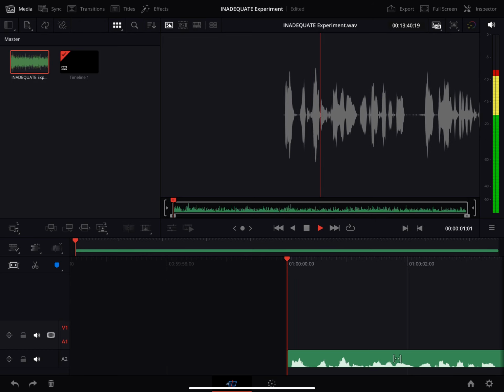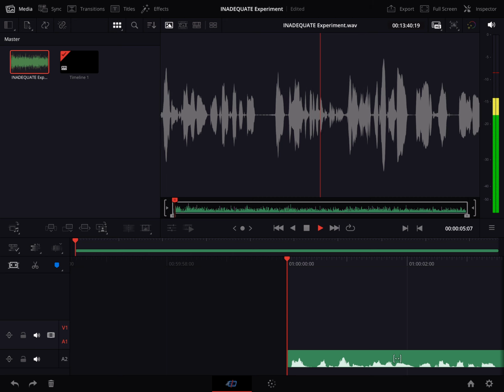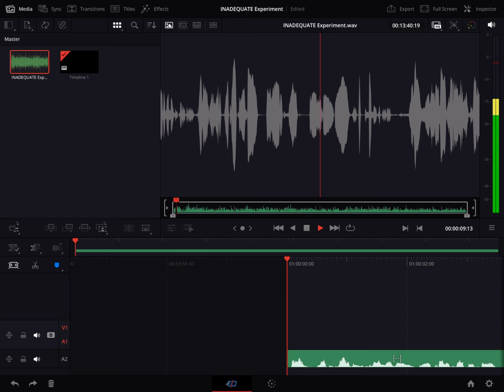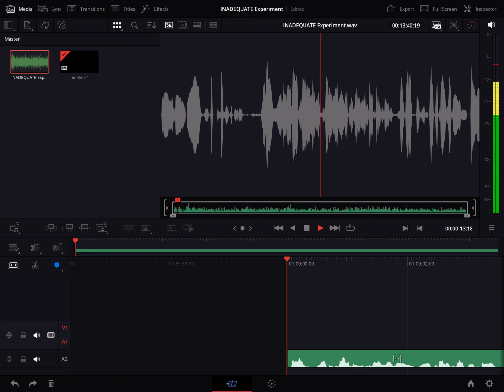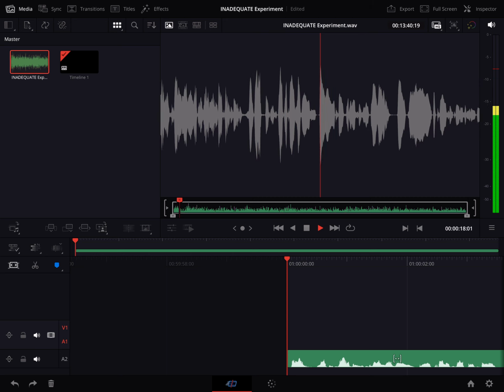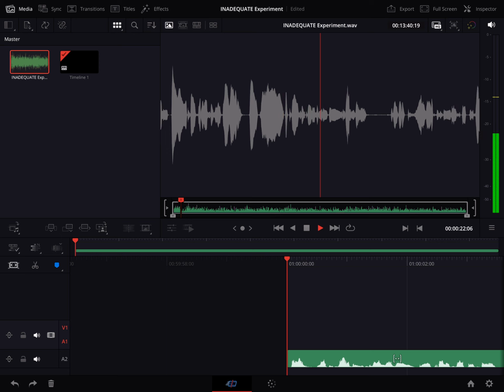All right, let's dive in. Today we're going deep on a topic that, well, the name's a bit of a head scratcher. It is, isn't it? We're talking about INADEQUATE NMR spectroscopy. You see that name and you kind of wonder what you're getting yourself into. Right. It's not exactly inspiring confidence, is it? Not really. But appearances can be deceiving, right?